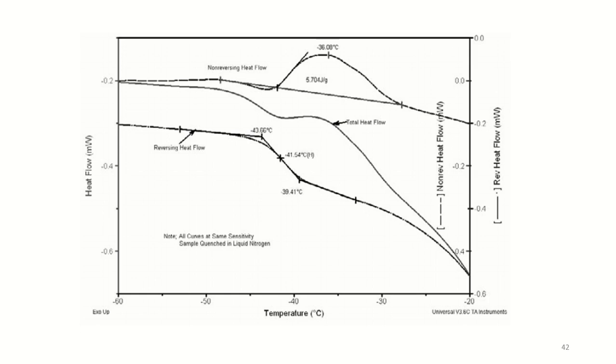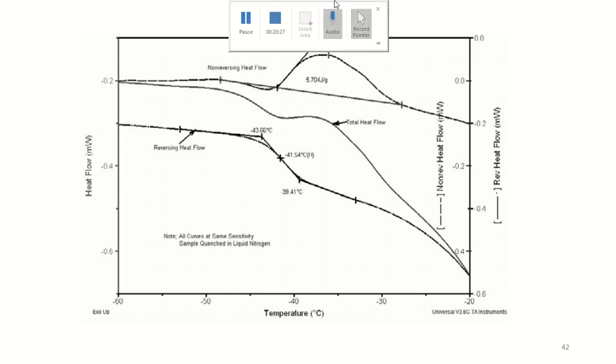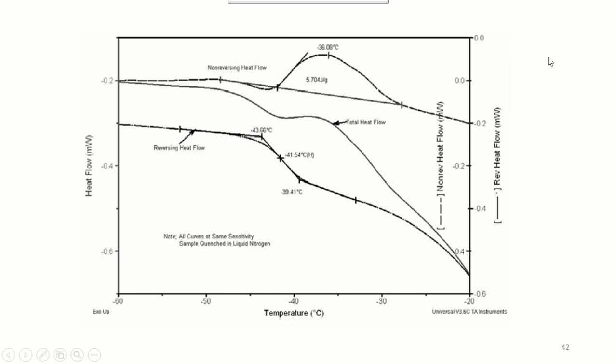In this case, modulated differential scanning calorimetry plays a vital role in the identification of different phase transitions that occur in a compound in close proximity of temperature.